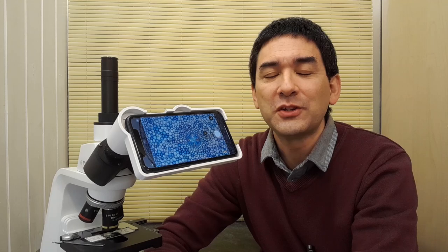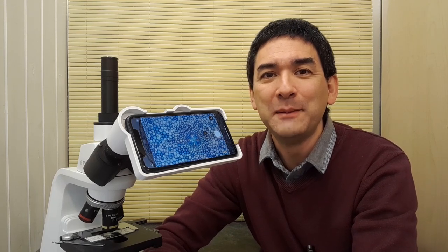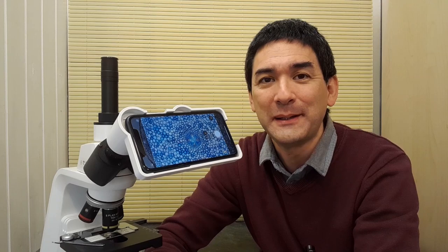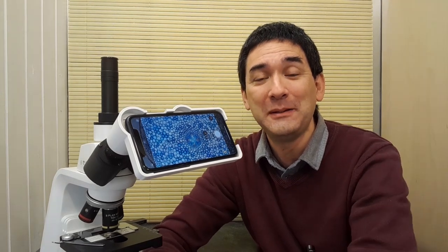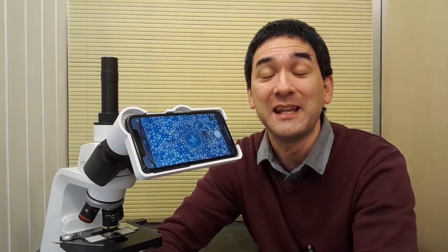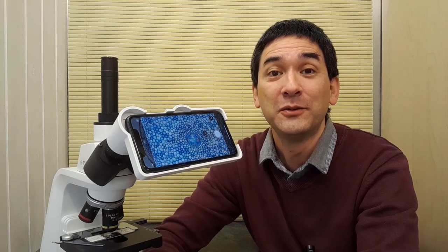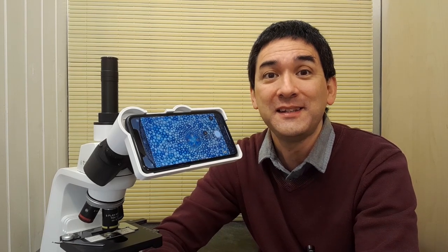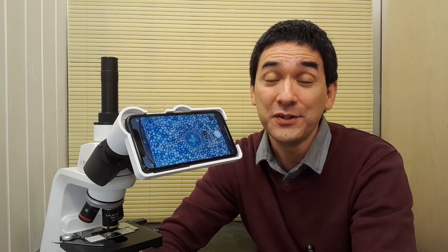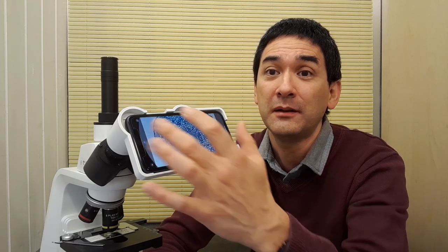So now let's talk a little bit about the biggest advantage and the biggest disadvantage of this adapter and it might surprise you a little bit because it's the same advantage and the same disadvantage and that is you're bound to an iPhone. This is a disadvantage if you have other mobile phones because of course as you can see it fits tightly and snugly into the iPhone.